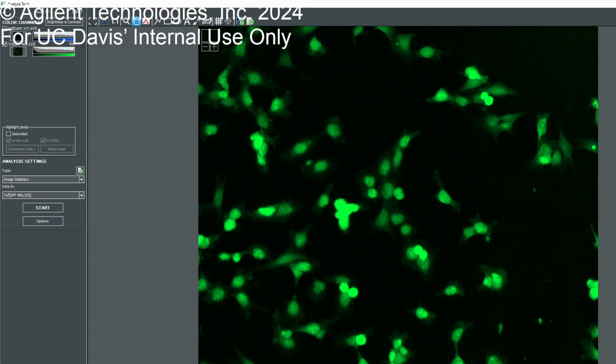So now we can see all the image level results here, right? So we have the mean intensity, which is 2700. We have the maximum intensity. So one of the peaks here is like 60,000 RFUs in fluorescence. There's this total intensity. So it gives you pretty good readouts if you are just seeking the image level results. One way you can also resolve that is now we know the background noise, right?